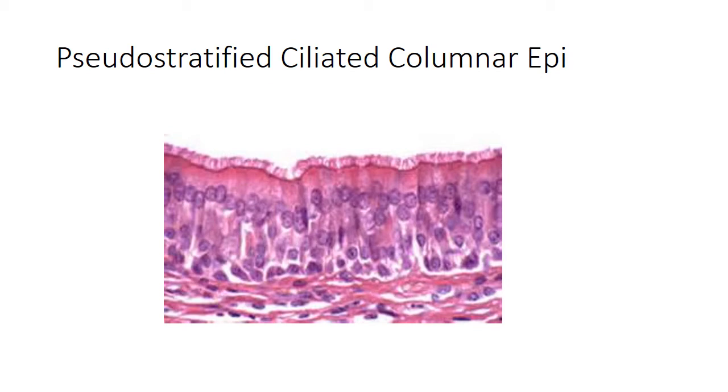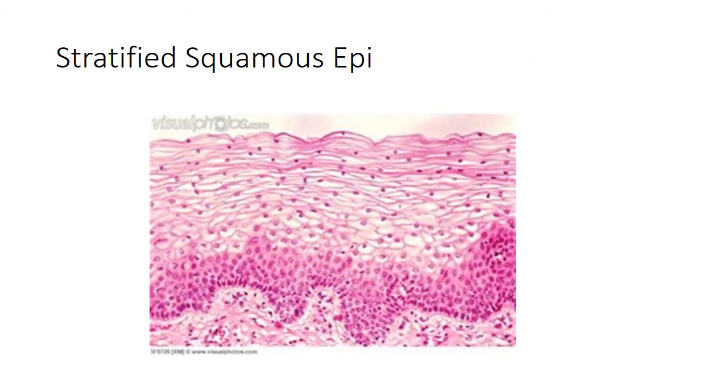Then we have the next epithelium. And this epithelium is stratified squamous epithelium. And with stratified squamous epithelium, well, you're going to find that in your skin. Find it in your skin. So I'll ask you just some basic questions. If you go back over chapter 4, lecture, real basic questions with this. One you got identified, and I'll ask you a basic multiple choice question on these.